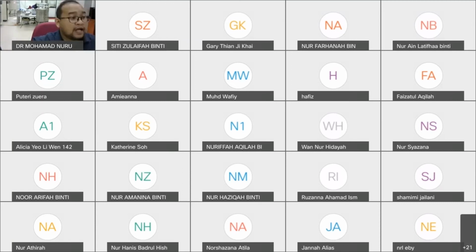And the NMR room will be open from 9 a.m. to 4 p.m. every day except weekend. So make sure you register your matric card in this form. Just write the NMR room and send this form to the office for us to key in.